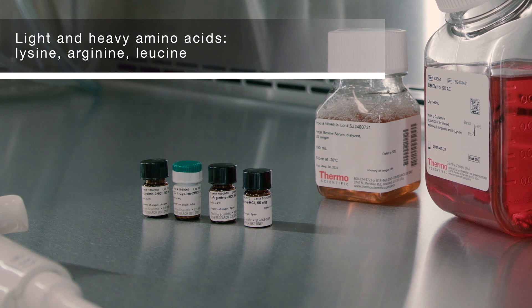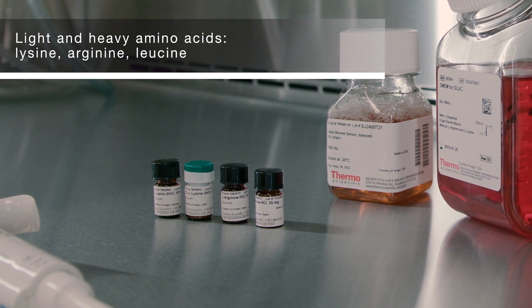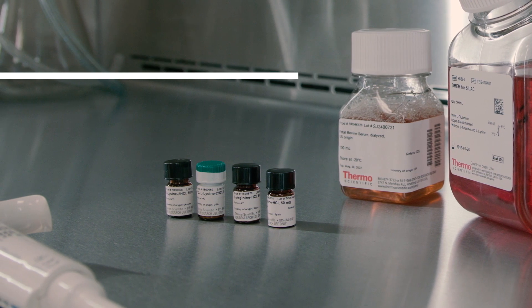We also offer multiple pack sizes of heavy and light lysine, arginine, and leucine amino acids.